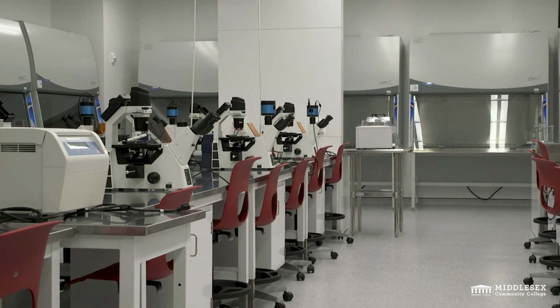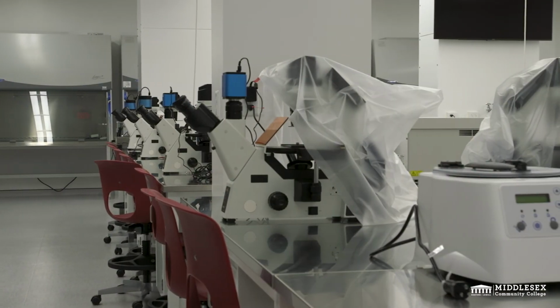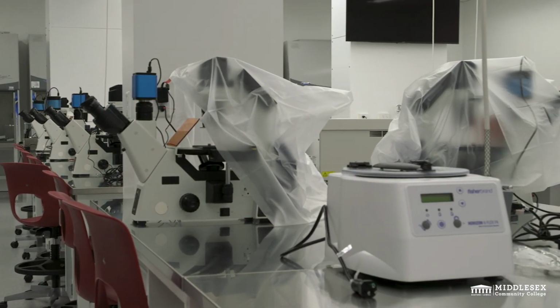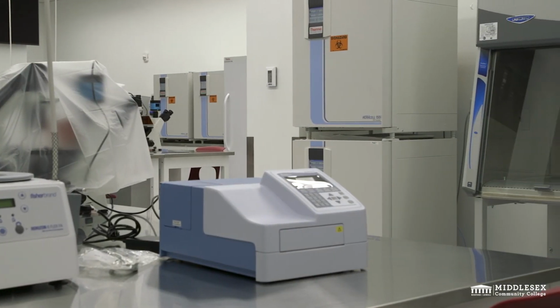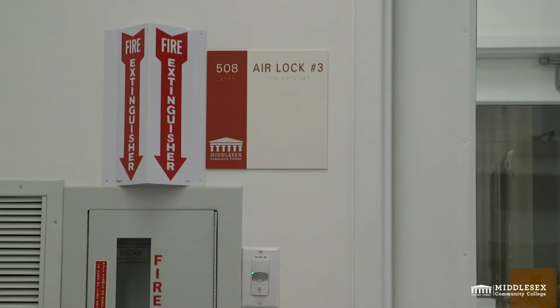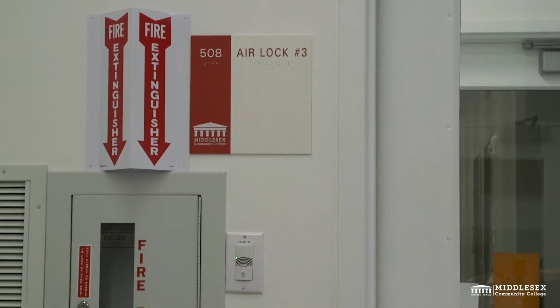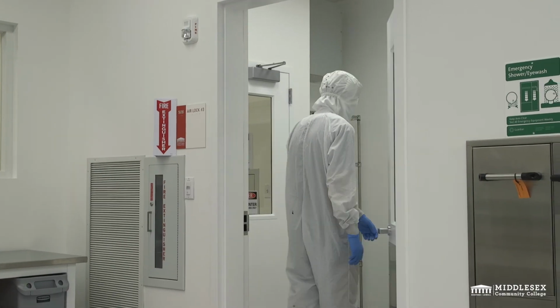Now that you have entered the clean room, you should always refer to protocols related to equipment usage, cleaning, and workspace protocols, as well as any other protocols related to operations involved inside the clean room environment. When you're ready to degown, enter Airlock 3.